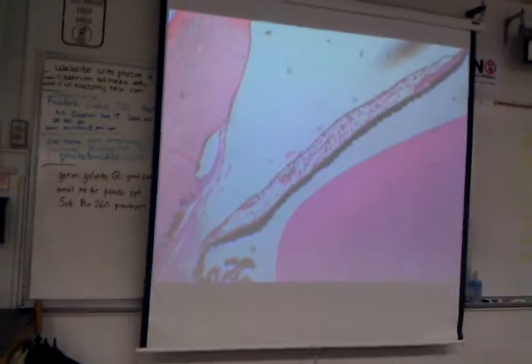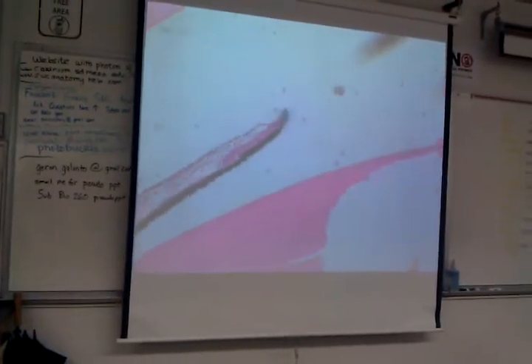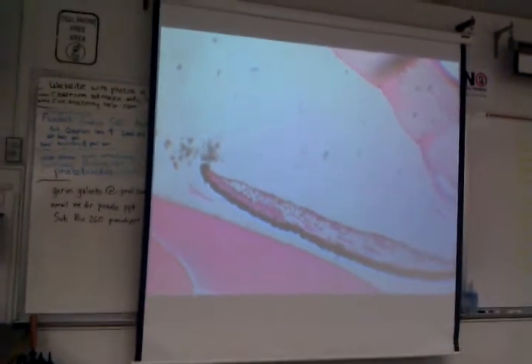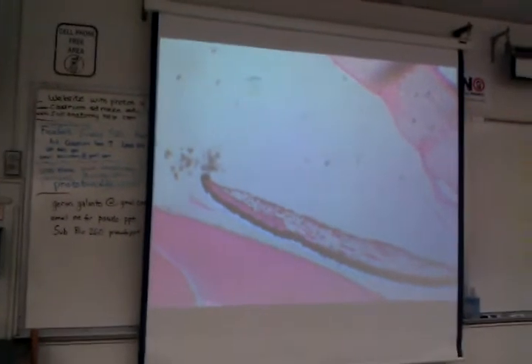Now let's do this. Because you just have to be able to put two and two together here. So the lens is just all kind of torn up. That's no big deal, right? So you can see here's the end of one iris. Here's the start of the other iris on the other side. So this is the other iris. This is still the lens.